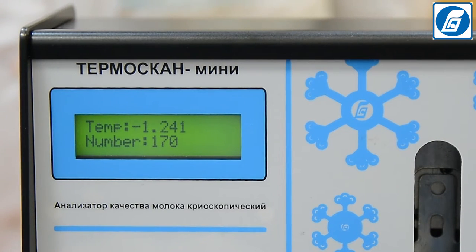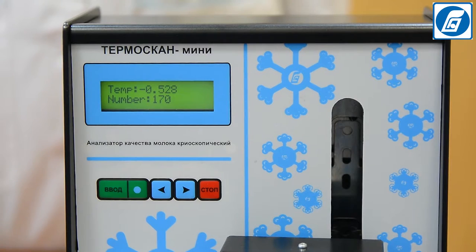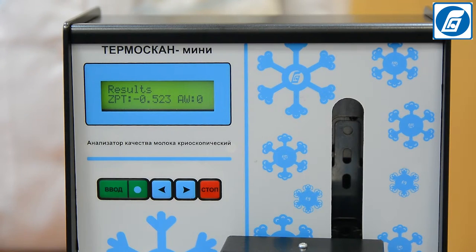Press Enter. The test tube with the milk sample is lowered together with the measuring head into the sample receptor of the cooling bath and the cooling process begins. On completion of the measurement, a short sound signal is given and the measured freezing point value is displayed on the indicator.